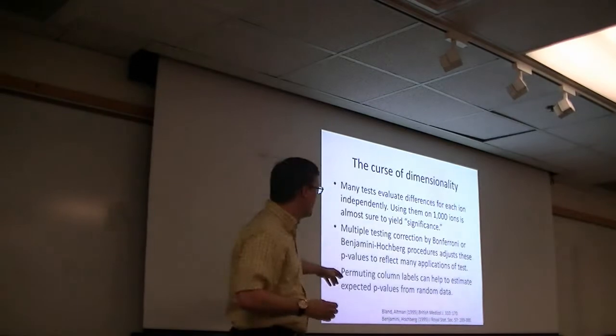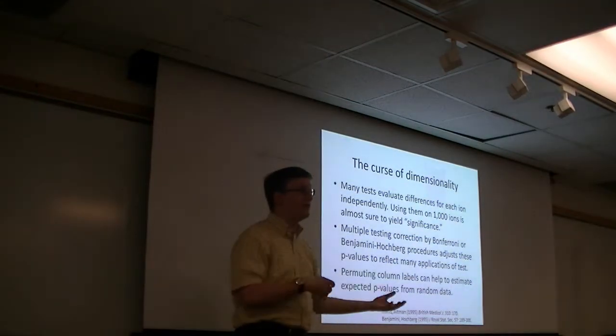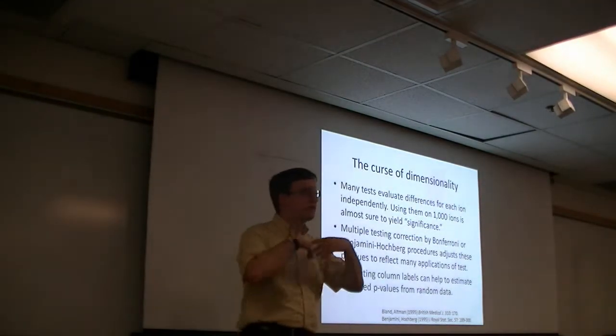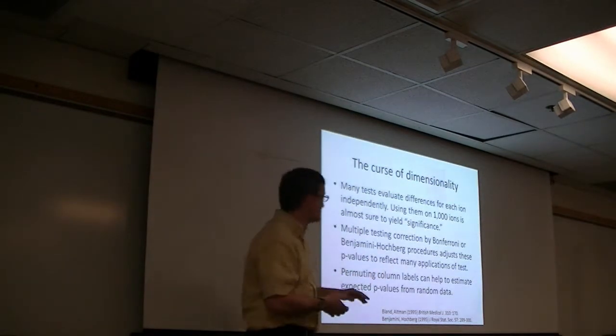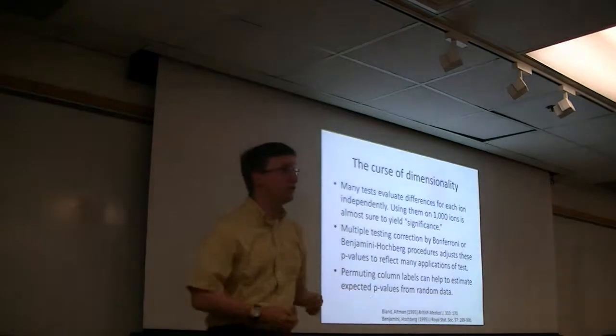So that gives you another way to correct what these p-values are, to evaluate in kind of a randomly shuffled distribution instead of using the Benjamini-Hochberg or Bonferroni approaches.